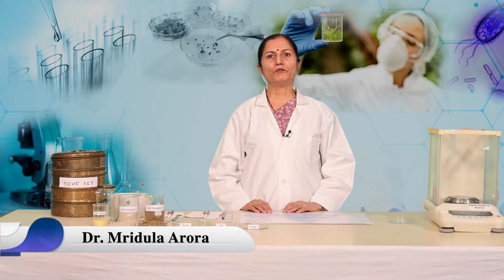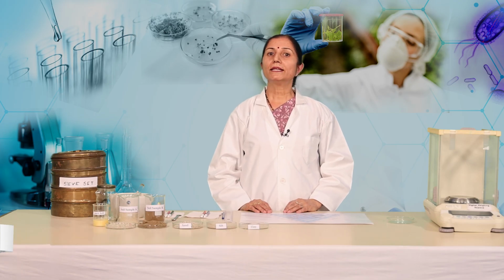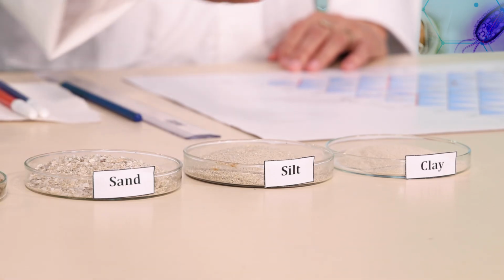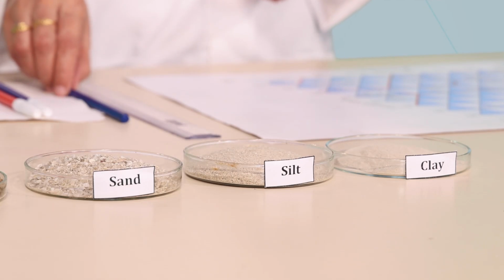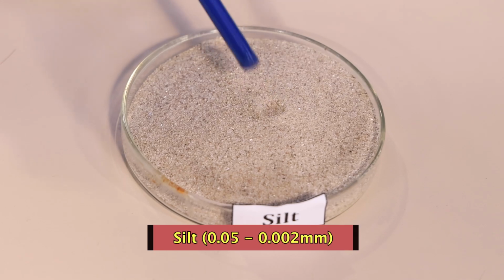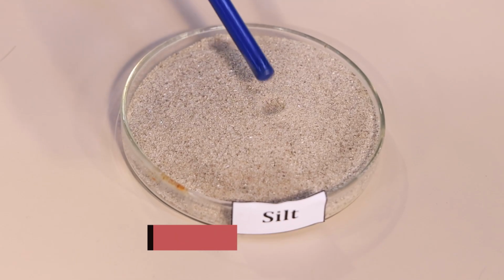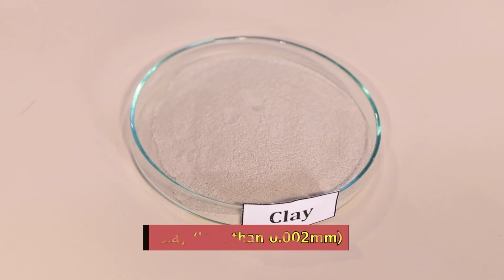Dear learners, texture is one of the most important physical properties of soil. The soil texture is based on the size of the soil particles. Normally, three types of particles having different diameters are present in the soil. These are sand with a particle diameter of 2 to 0.05 millimeter, silt with a particle diameter of 0.05 to 0.002 millimeter, and clay with less than 0.002 millimeter diameter.